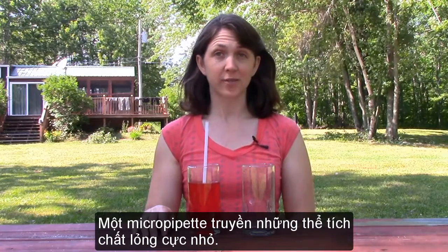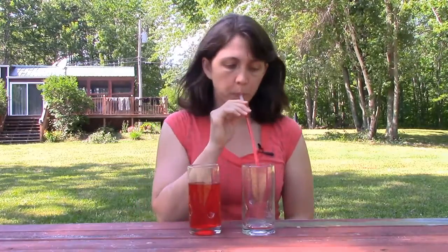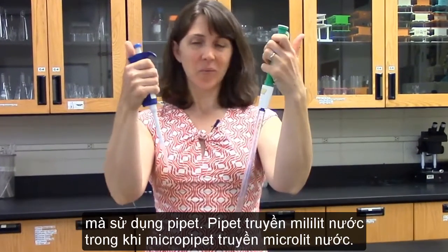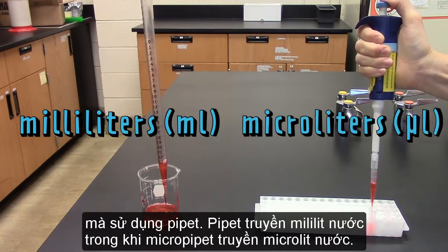A micropipette transfers tiny volumes of liquid. It does this by drawing up the liquid like this. Of course, in lab, we don't transfer liquids using straws. We use pipettes. Pipettes transfer milliliters of water, while micropipettes transfer microliters of water.